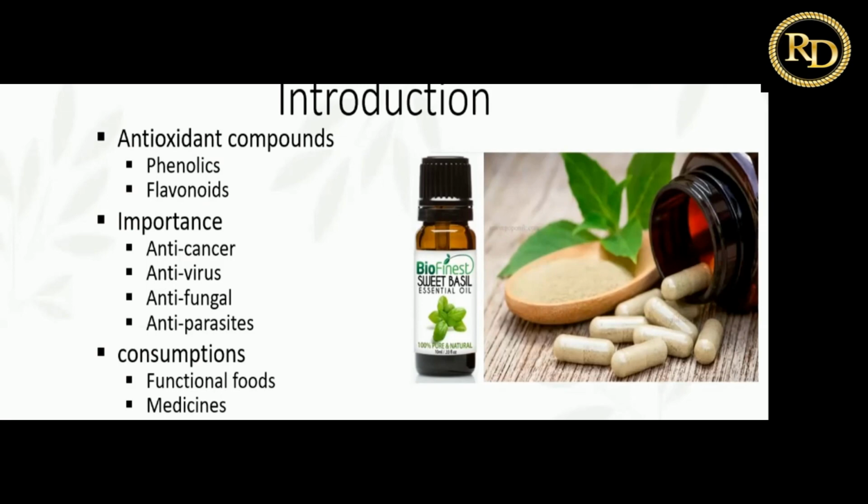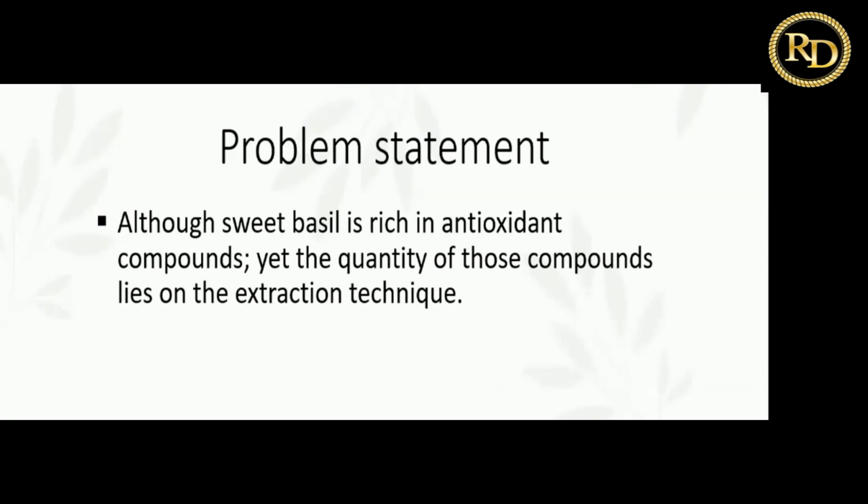During the extraction process, 10 grams of leaf powder was mixed with 100 ml of solvent and subjected to various levels of temperature and concentrations of ethanol. The extraction was performed using a water bath, and the mixture was subjected to filtration and then introduced to a rotary evaporator to evaporate the solvent. After that, the dry extract was stored at minus 20 degrees Celsius for further investigations.